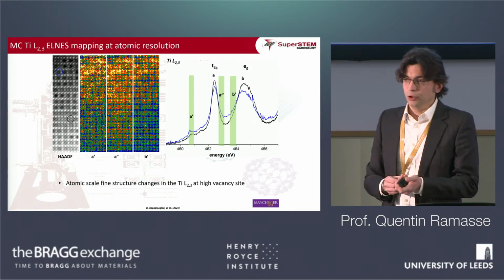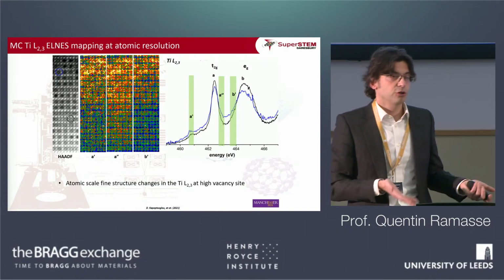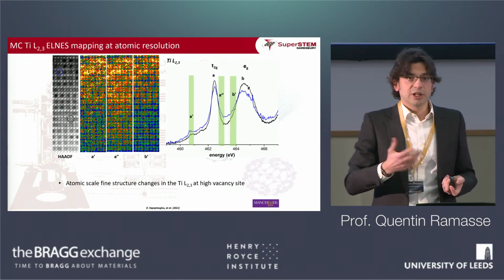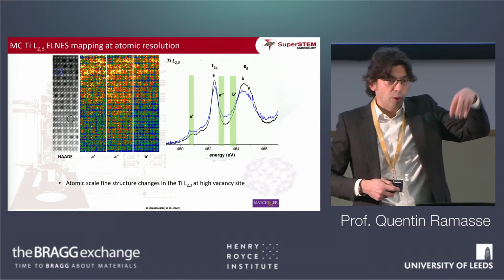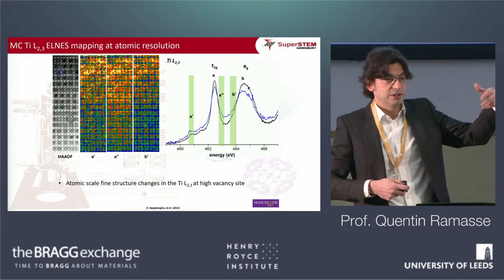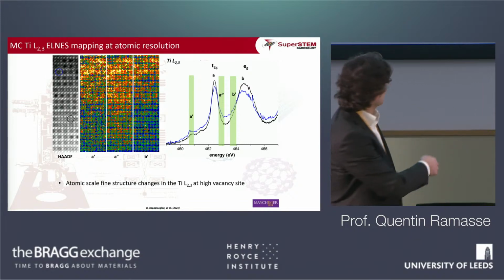Again, it's an absorption spectroscopy very similar to XAS. In this particular case, if you lose about 450 electron volts, this is characteristic of titanium, and you can create maps position by position of how much locally you have of titanium, or how much titanium is missing locally.